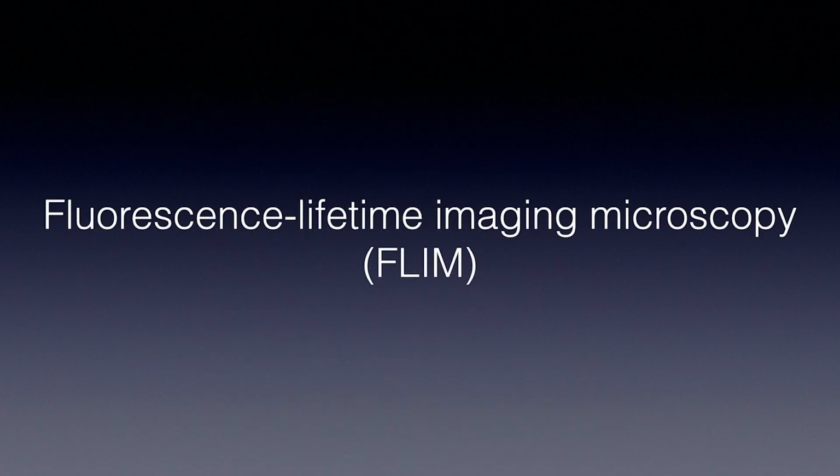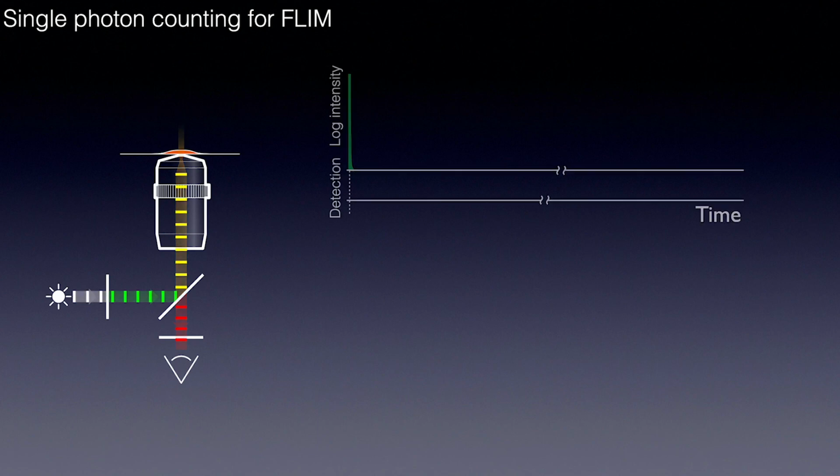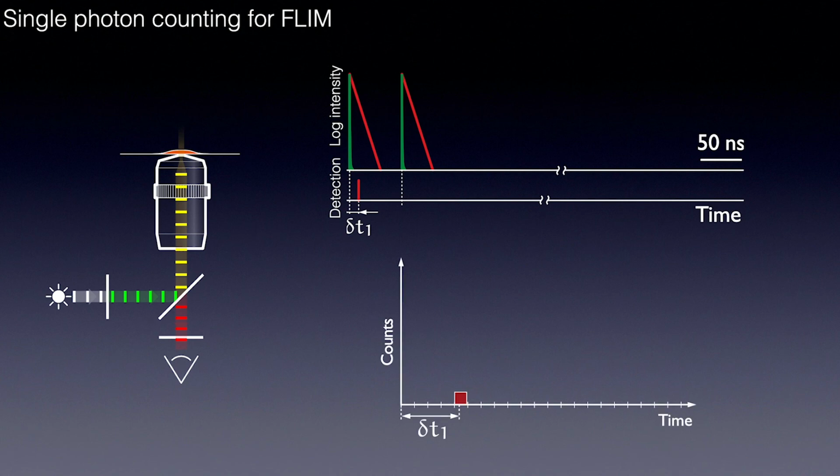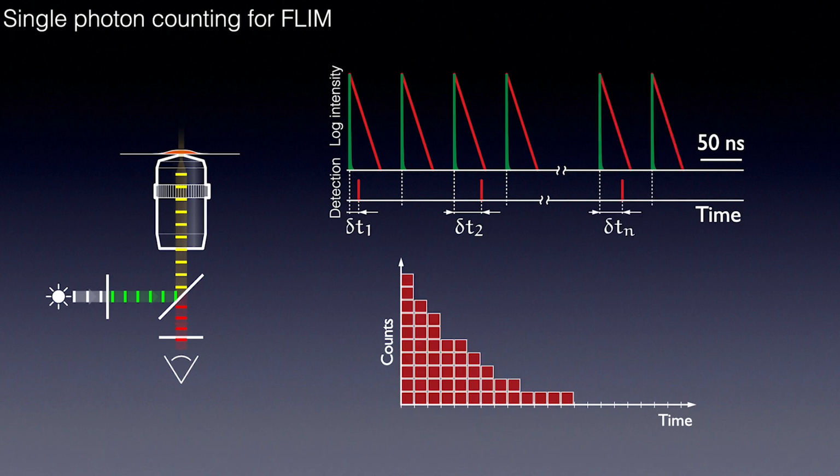FLIM, Fluorescence Lifetime Imaging Microscopy. With LINCam, we can use virtually any fluorescence microscope. What we do is exchange a continuous light source for something pulsed, like a laser. Then what happens? We send an ultra-short light pulse into the sample. The sample gets excited, and after some time, we get a fluorescent photon back. Only a fraction of the excitation pulses result in fluorescent photon, so we repeat this process many times until we acquire enough photons to extract the lifetimes.